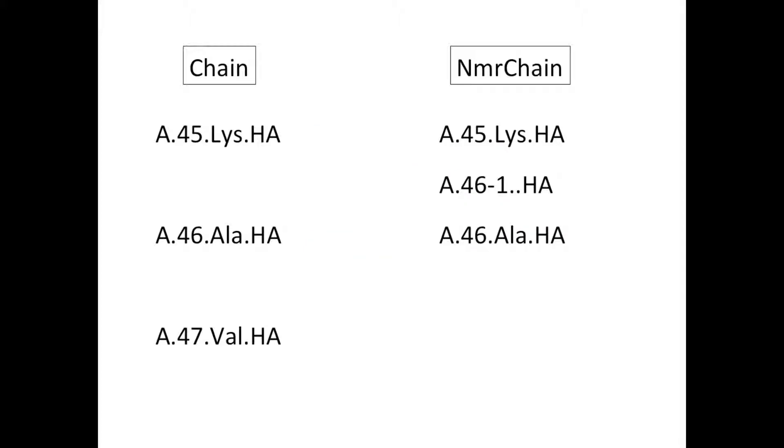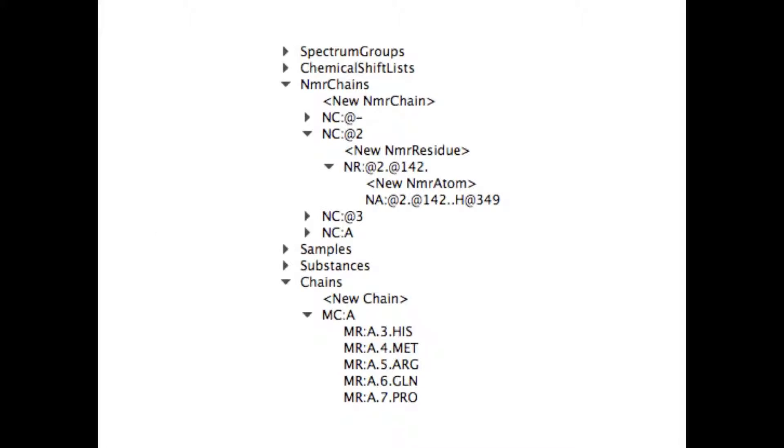And so when you make your assignments, the NMR atoms in your NMR chain now become the same as the real protein chain. An NMR atom is defined as being assigned when its label matches an atom label. You can find your chains and NMR chains in the sidebar with residues and atoms nested beneath them. There are many easy tools available to edit existing or create new NMR atoms, residues and chains.